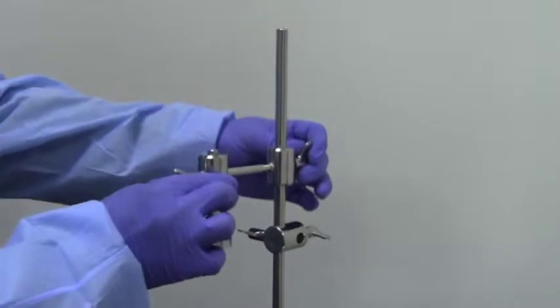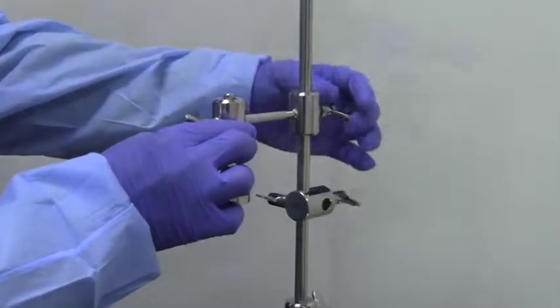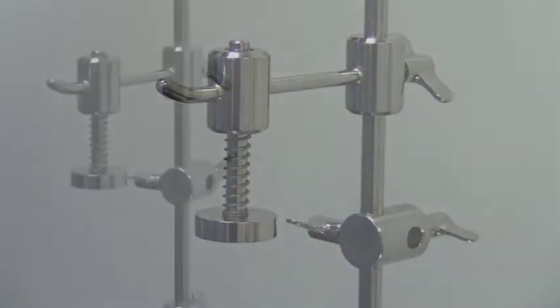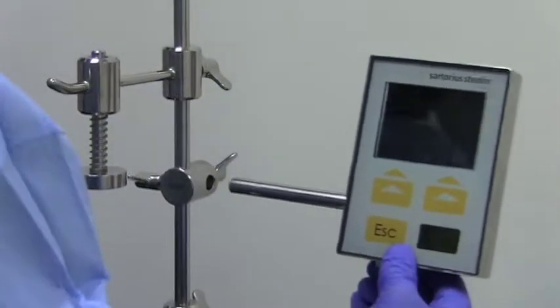Next, attach the spring-loaded bottle holder. This keeps the tension between the holding ring and the bottle. Place the control unit in the holding clamp.